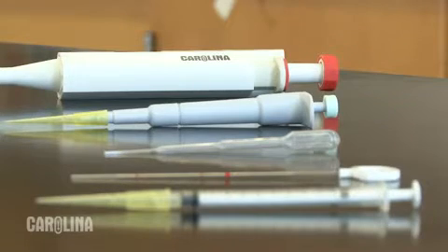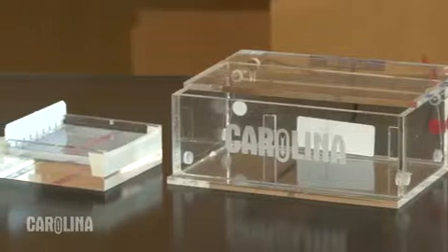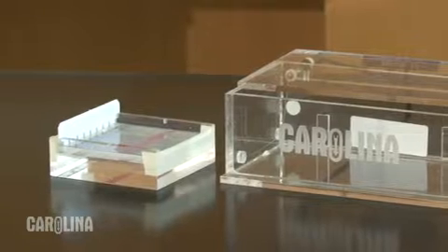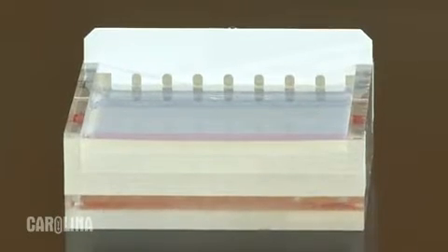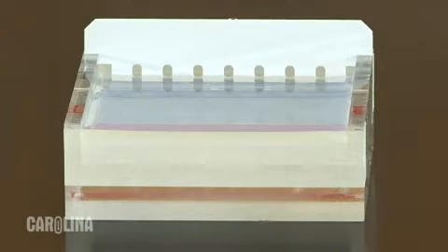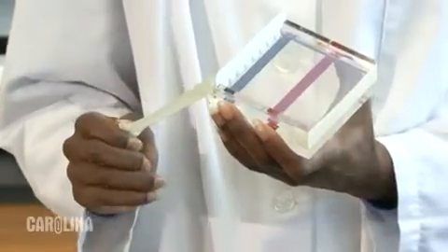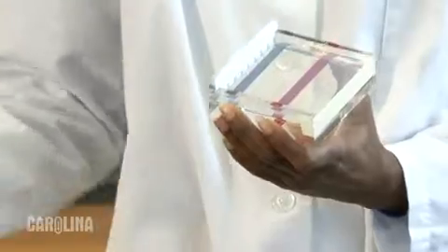Which one you use depends upon your budget, the lab you are doing, and personal preference. The gel I am using has been pre-poured. The wells in this gel will comfortably hold 28 microliters. If you try to load too much sample, some of it will flow out of the well and may contaminate adjacent wells. For these demonstrations, I will load 20 microliters.